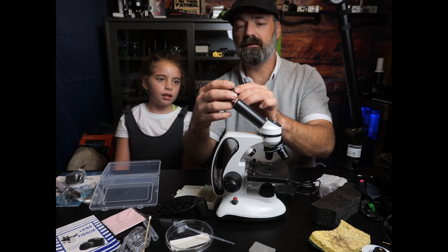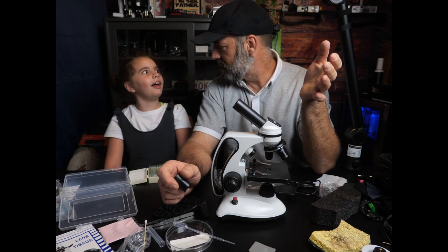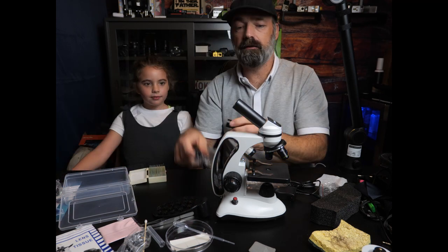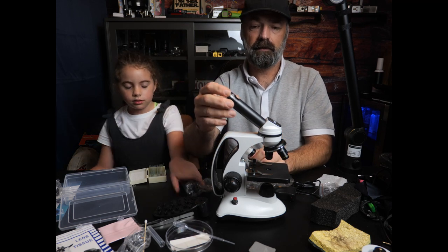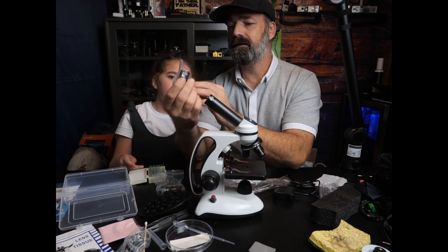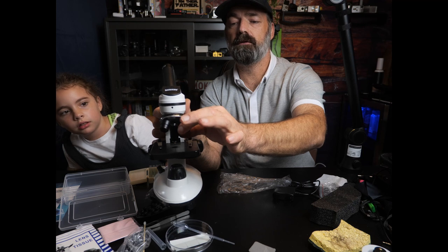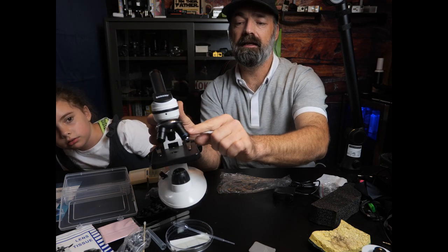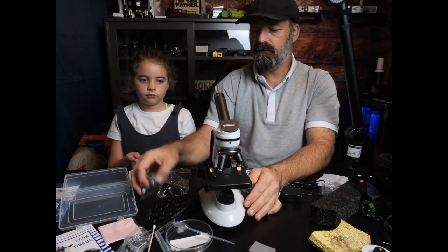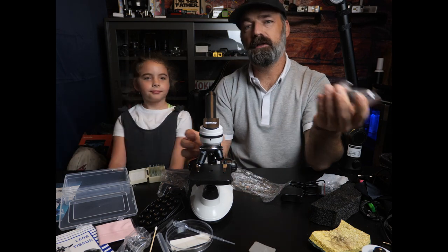The magnification on this goes from 40 times all the way up to 2,000 times. So you can make something 2,000 times bigger. That's what all these extra eyepieces are — a 25 times, a 2 times, and a 10 times. And the way it works is you have your eyepieces combined with the lenses on the microscope, which are rated 40 times, 4 times, and 10 times. Using simple math — if you take the 10x eyepiece and you put it with the 10x lens, you're going to get 100 times magnification.